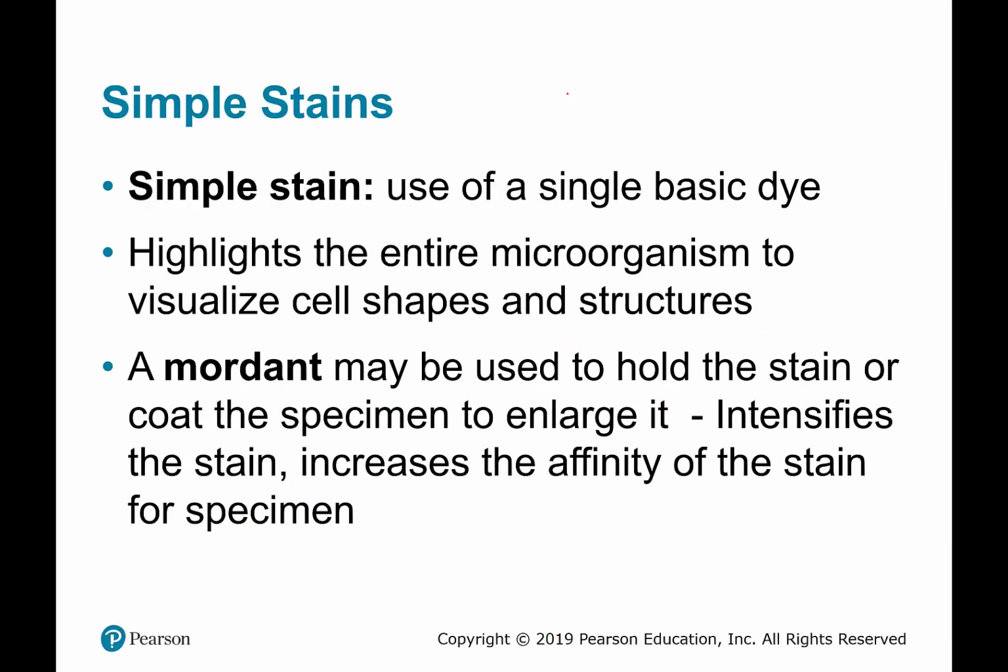So simple stains use a single basic dye. You can highlight the entire microorganism to visualize cell shape as well as structures. If you use a mordant, you can actually visualize the flagella. A mordant is going to be used to hold the stain or to coat the specimen to enlarge it. So it's going to intensify the stain and increase the affinity of the stain for the specimen. So if you're going to try to visualize flagella, you're definitely going to use a mordant. You also use a mordant with the Gram stain. So it's going to better adhere that stain to the specimen.